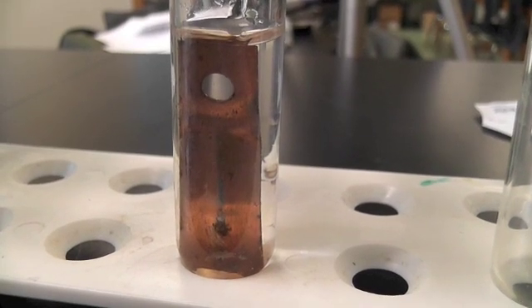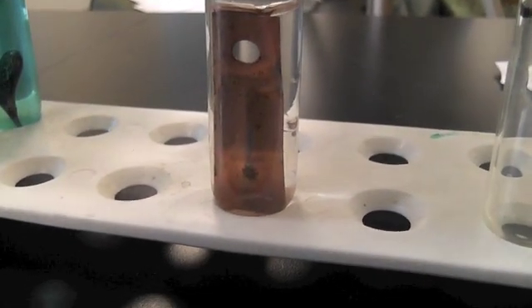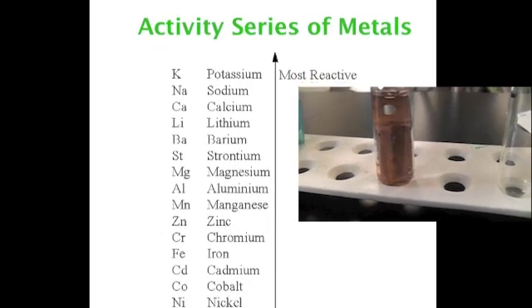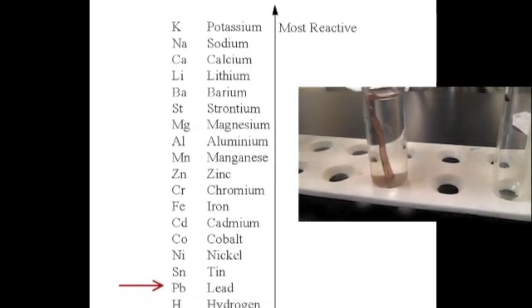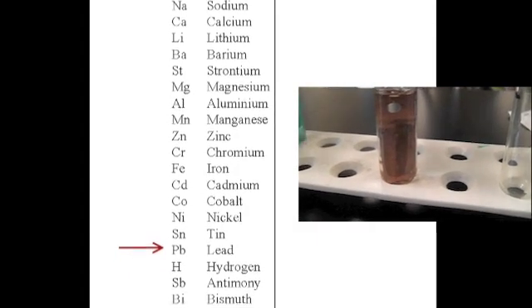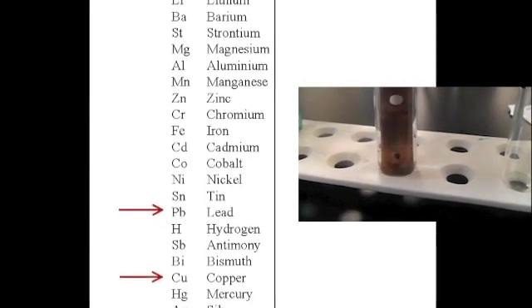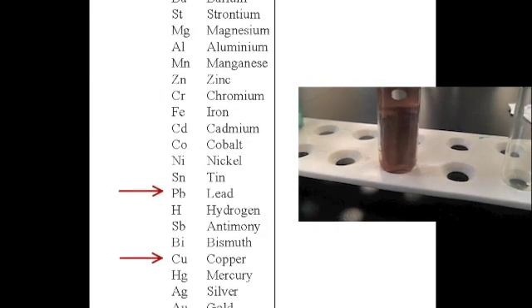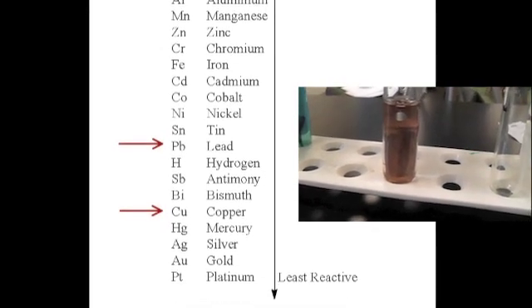We'll drop the copper right in, give it some time, and you'd expect something to change — but in this case, it will not. If you look at the activity series of metals, lead is above copper. Therefore, when you put a piece of copper in, the copper is less active and will not displace the lead. So nothing's happening — it does not happen with every metal. Putting copper in lead nitrate will have no reaction.